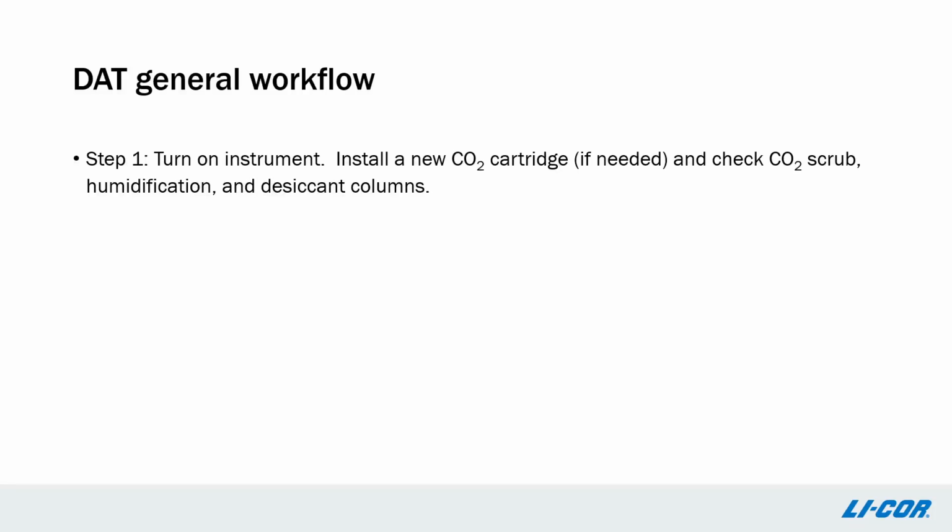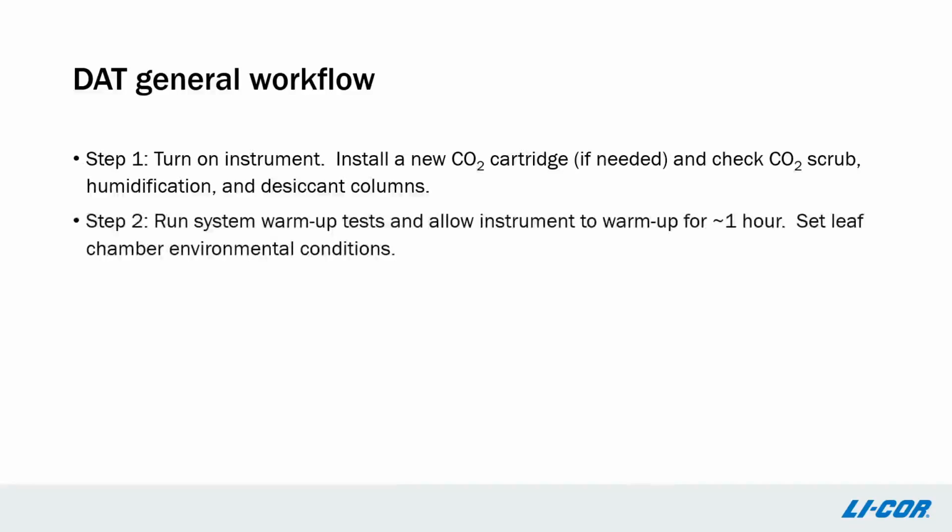Step 1. Turn the instrument on, install a new CO2 cartridge, and check the CO2 scrub, humidification, and desiccant columns on the back of the instrument console. Step 2. Run the system warm-up tests and allow the instrument to warm up for about an hour.